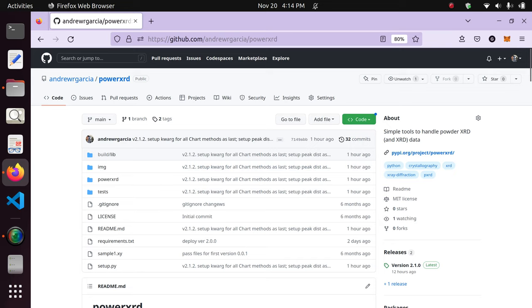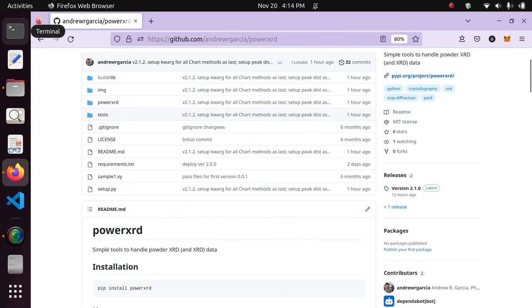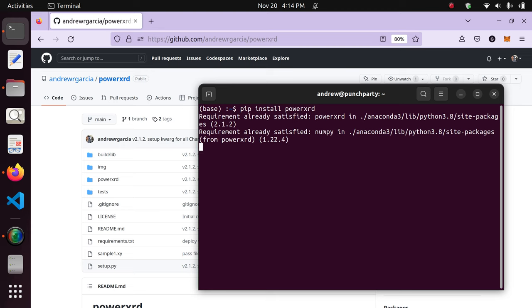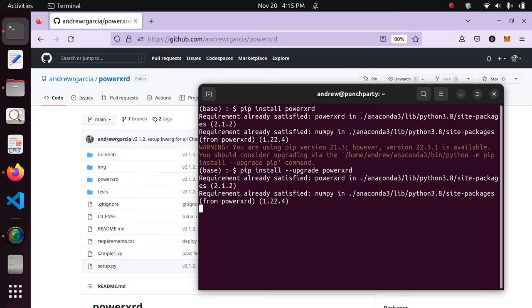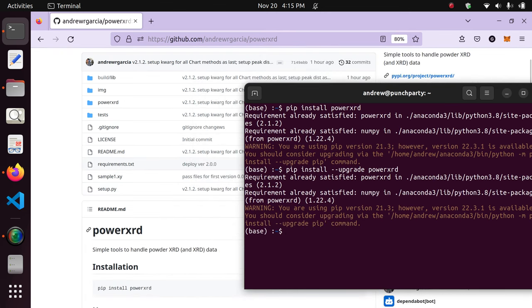You don't need to clone the repository to install this package. To install it, you just need to open a terminal and type 'pip install PowerXRD'. This will install the PowerXRD package to your Python package manager. I've already installed the latest version. If you've installed a former version and want to upgrade, you just have to type the upgrade flag before PowerXRD, and it will upgrade to the latest version.